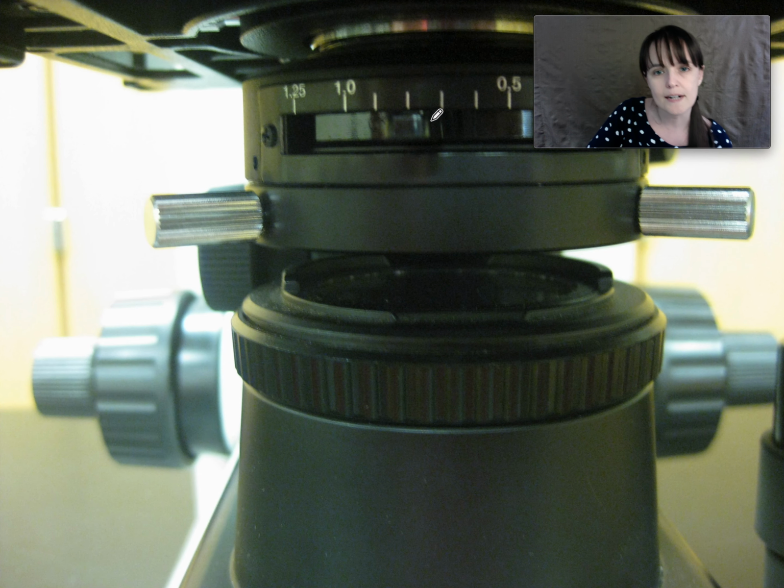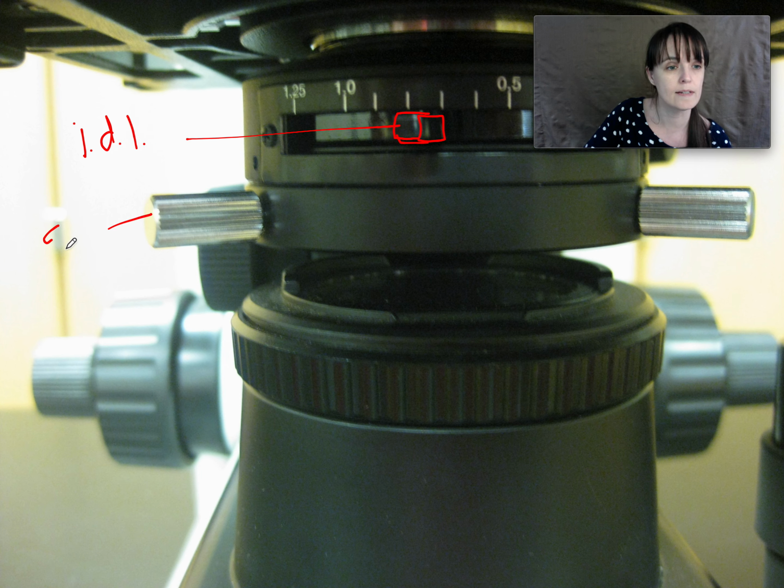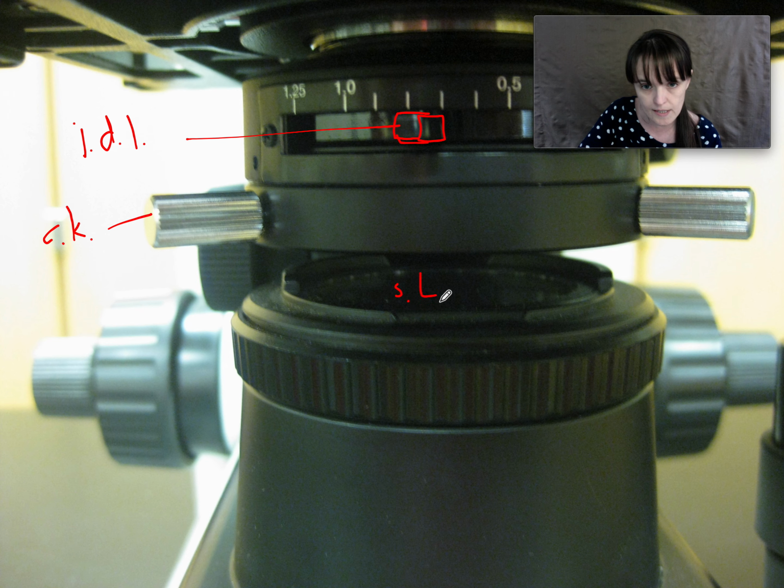Oh, here is the iris diaphragm lever and the condenser knob. And this is the substage light. It's substage because sub means under, and it's under the stage. So it's the substage, under the stage. It's like a sub-basement is under the basement.